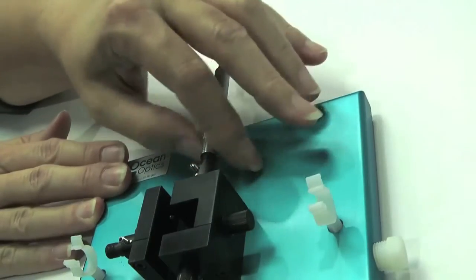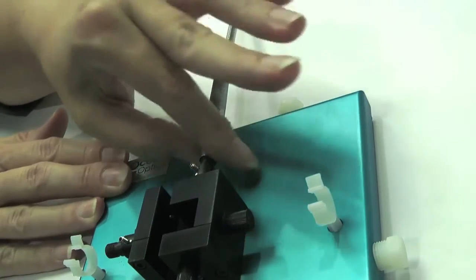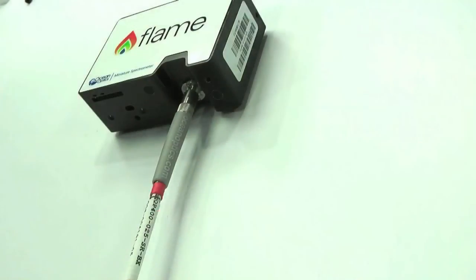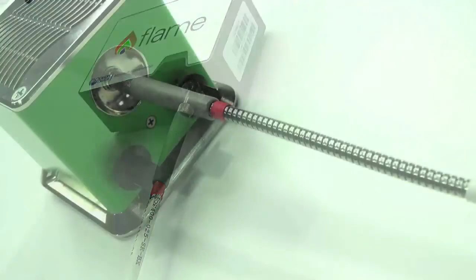Now attach the two fibers to the remaining SMA connectors at 90 degrees to each other. Connect the other end of one fiber to your spectrometer and of the other fiber to your light source.